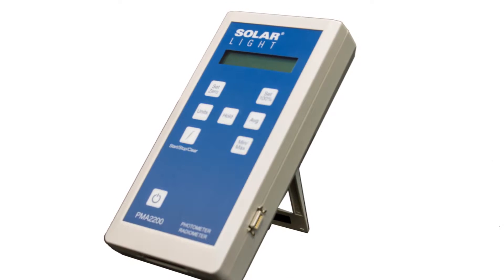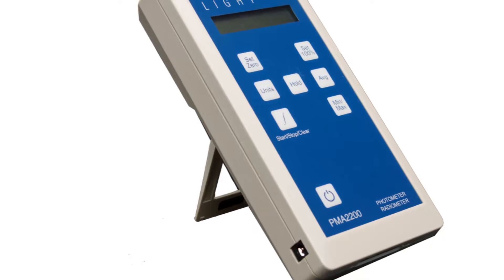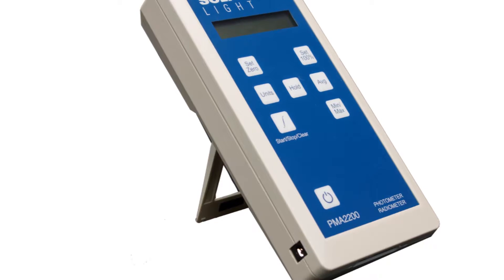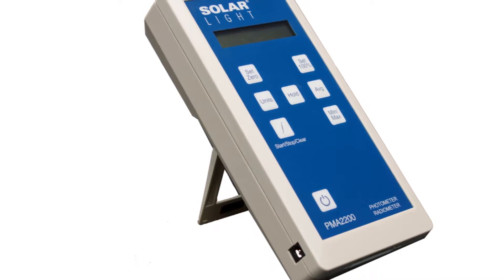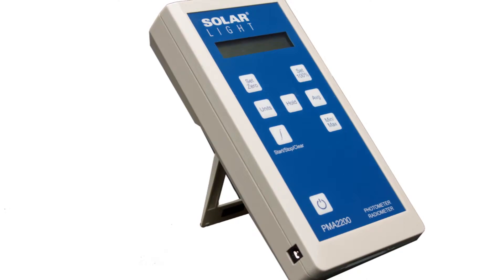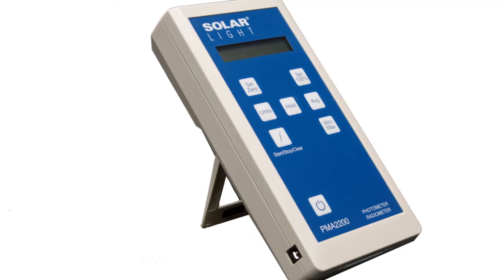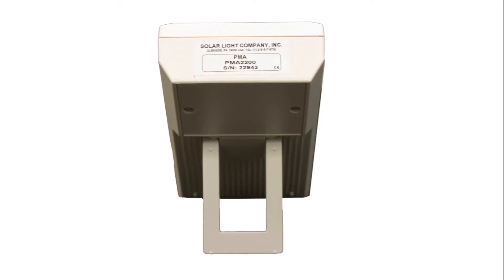This streamlined model allows all functions to be operated directly from the keypad. It features graphic display, complex processing algorithms, selectable units of measure, averaging, tracking minima and maxima, and programmable alarm thresholds, all in one small handheld device.